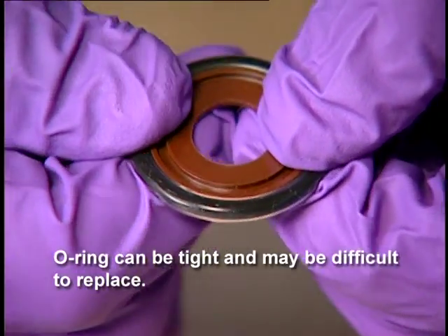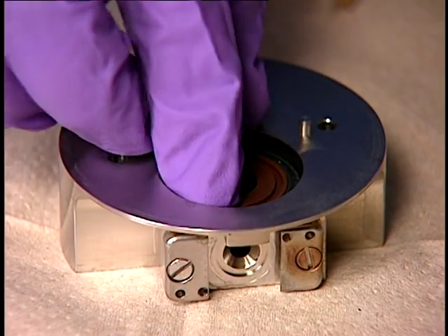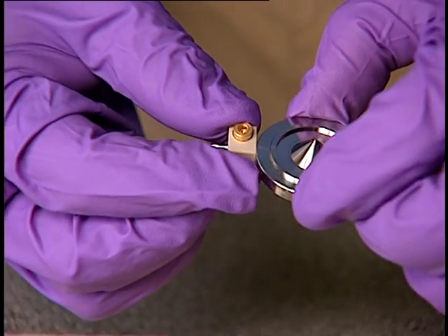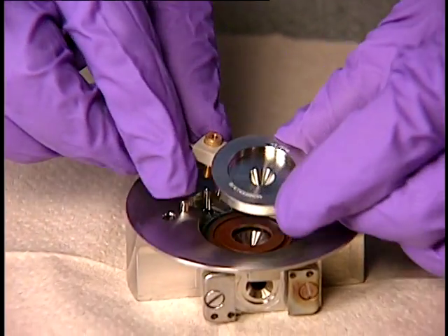Begin by replacing the extraction cone seal O-ring. Then insert the extraction cone seal into the ion block. Fit the extraction cone retainer to the extraction cone. Insert the extraction cone into the ion block.